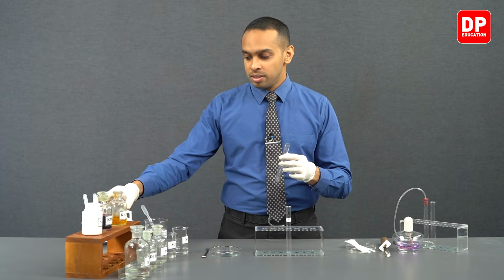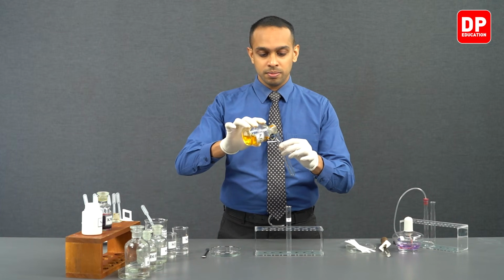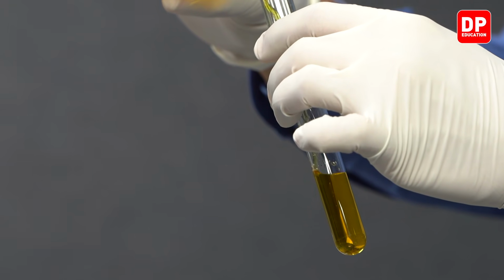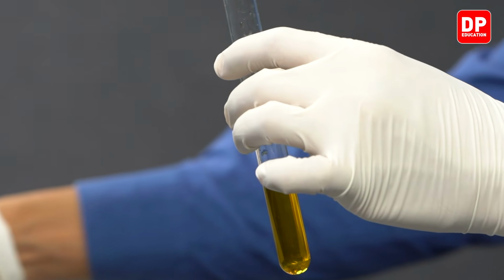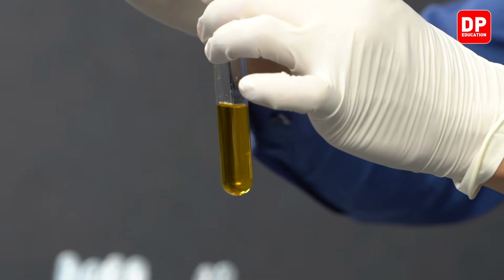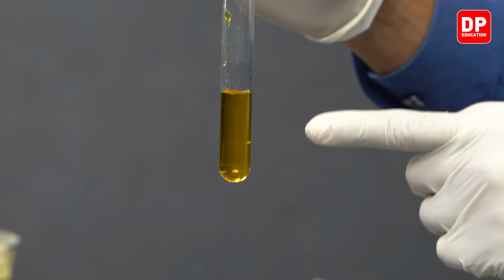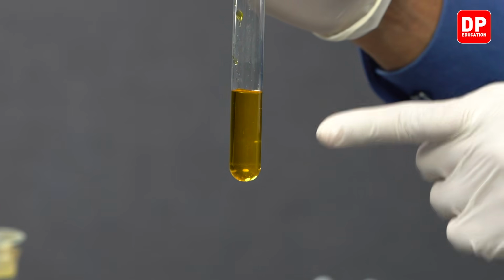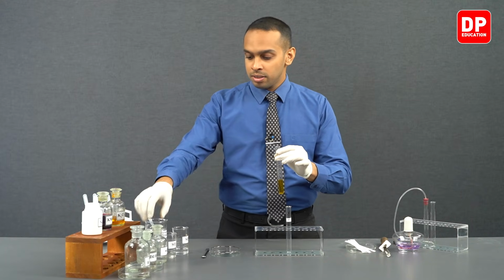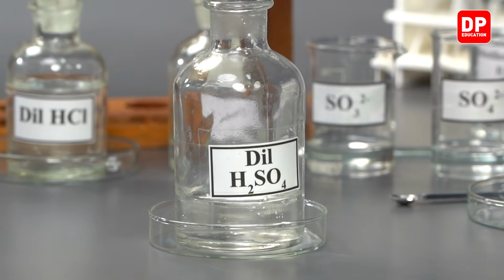Let's transfer a small volume of potassium dichromate into our test tube here. So we have transferred a small volume of potassium dichromate into our test tube. You can observe the color very clearly. Potassium dichromate is an orange color solution, and to this we can add dilute sulfuric acid.